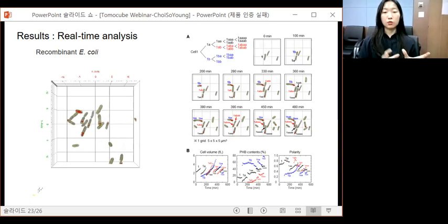And this movie corresponds well to the result that the E. coli cell shows higher polarity and negative correlation between polarity and PHA contents in the previous slide. Look at the right side. The dynamic changes shown in the time-lapse movie were also quantitatively analyzed at the individual cell level.